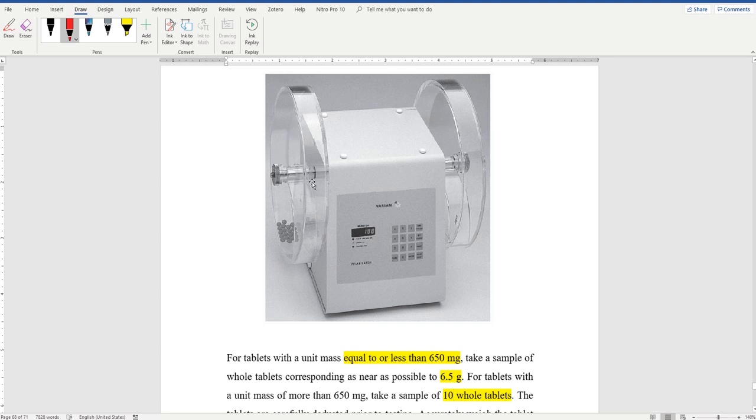Now, friability means the breaking ability of the tablet. If the average loss is more than 1%, then it fails the test. If there is any clear visible breaking in the tablets, it also fails the test.